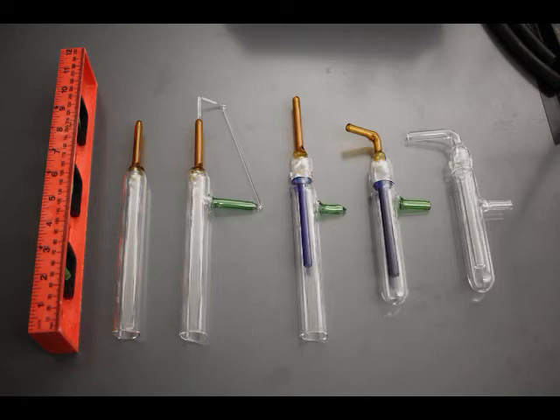this video series of making the bubbler, hopefully that's been useful. I will probably continue making other videos that are related to this bubbler construction. If you want to make, for example, a reflux condenser, the bubbler design is very similar to a reflux condenser. So if you've mastered these skills, butt seal, side seal, ring seal, then you're ready to move on to more complex scientific glassware like a reflux condenser.